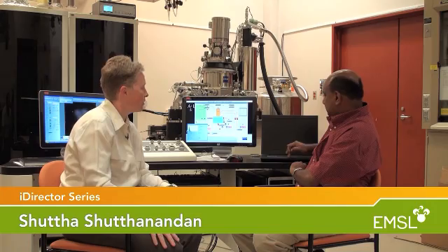Okay, I'm here with Shuta Shutananen in the Helium-Ion Microscope Laboratory. I just want to ask you a few questions, Shuta, get to know you and the microscope.